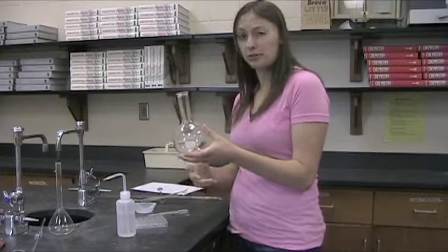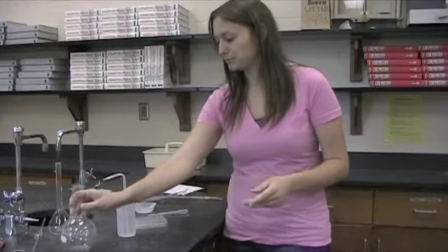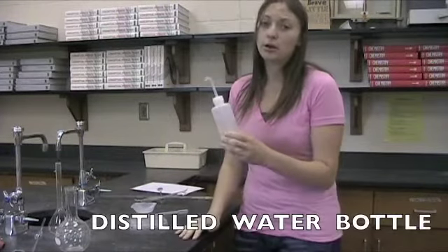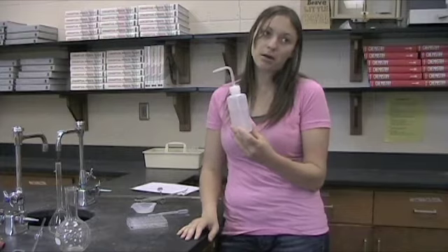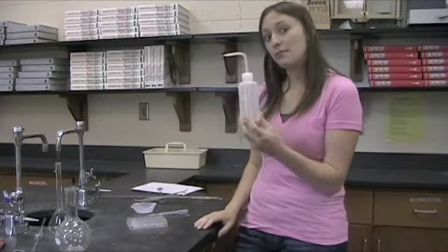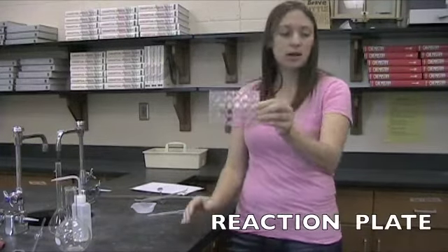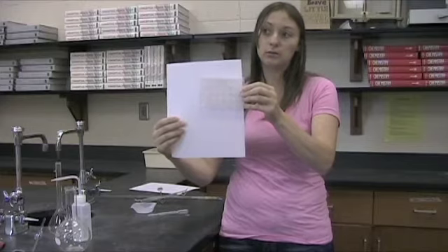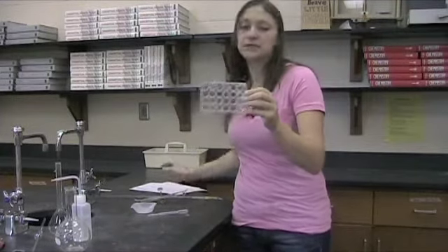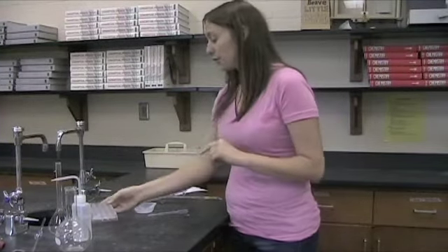We have what's called a florence flask. This is not something you are going to use very often. It's kind of like a beaker or an Erlenmeyer, just in different shape. We have a distilled water bottle or a DI water bottle. So the water in these is not tap water. They have to be filled up in one of the two DI water jugs on the side of the room. So do not put tap water in these. This is called a reaction plate. And what you will notice is they have a whole bunch of little what are called wells. And that way you can see lots of different reactions. You can compare them, these are going to be very small solutions. We will use these a few times throughout the year.